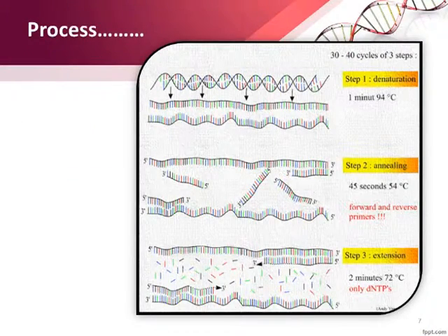There are many steps involved in the PCR process. Step 1. Heat separates double-stranded DNA into single-stranded DNA, since the hydrogen bonds linking bases to one another are weak. They break at a higher temperature, whereas the bonds linking deoxyribose and phosphate are strong covalent bonds.